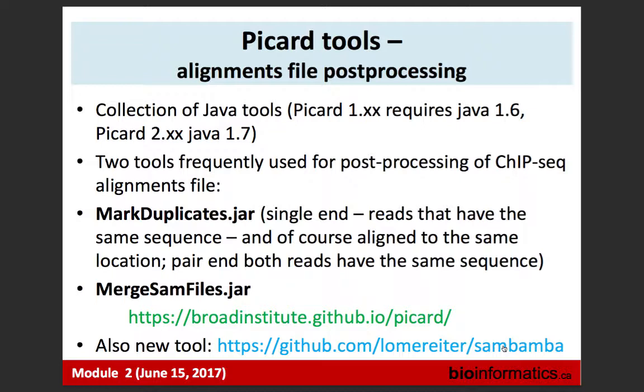Even if the base pair is removed by the trimming? I have to look up the certain criteria for how many mismatches you allow when you consider those molecules different, but it's pretty loose. Rule of thumb, if they align to the same coordinates, they are considered duplicates. And this will be filtered not by quality, but by the duplication flag.